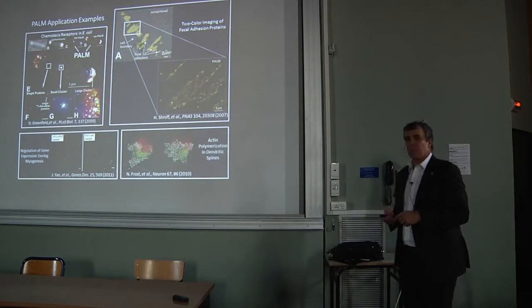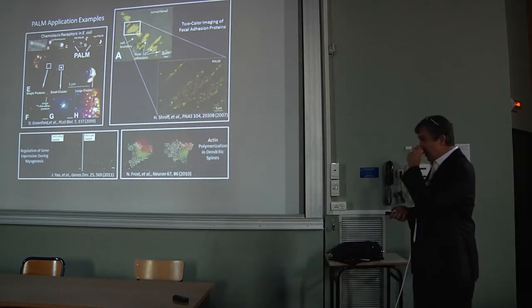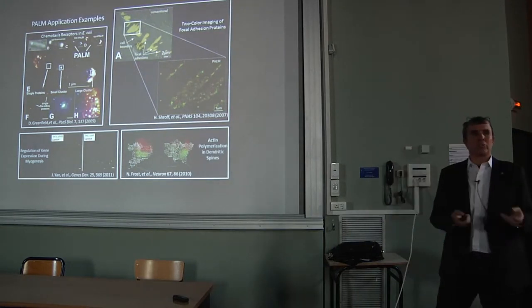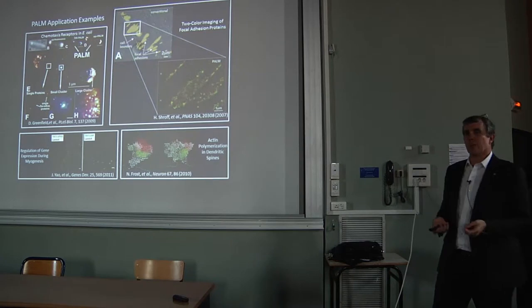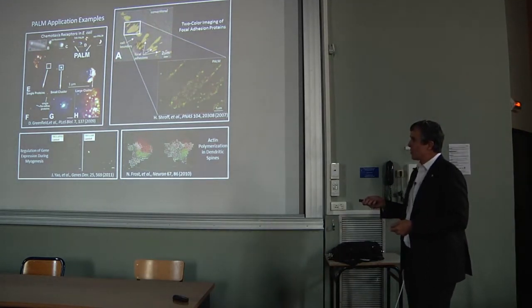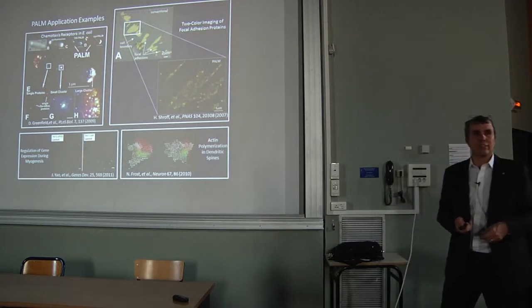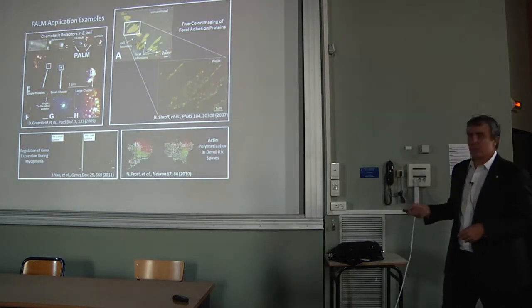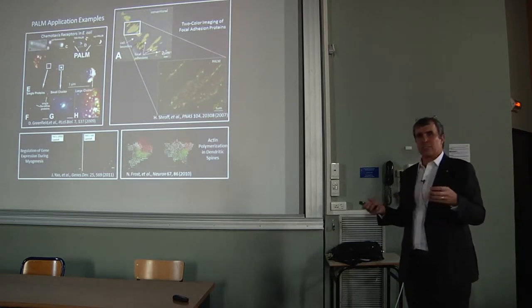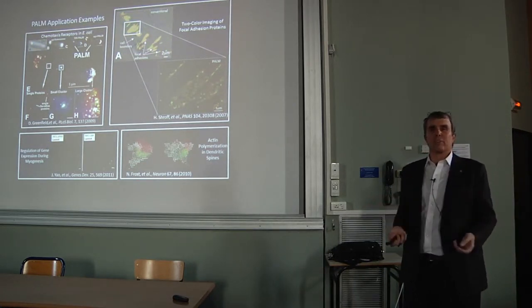In another example with Bob Tjian at Janelia, we were able to show that these green dots, which represent core promoters which are necessary for transcription of DNA, are spatially segregated from the genes which hug up against this red nuclear membrane. And that spatial segregation is one means by which the cell regulates when certain genes are turned on.